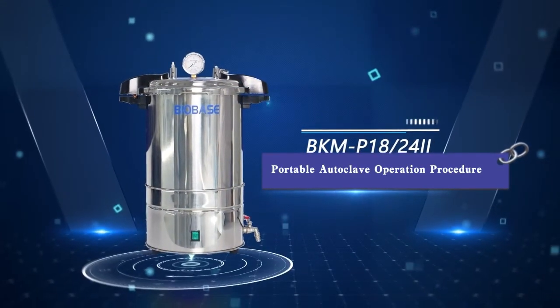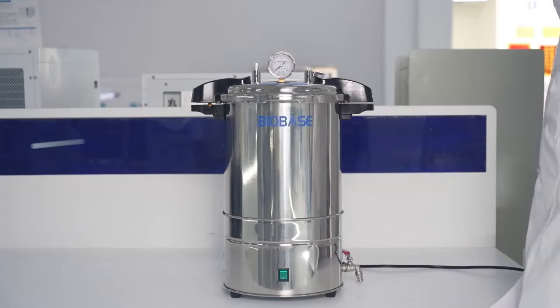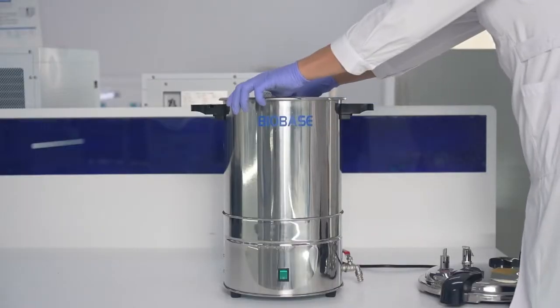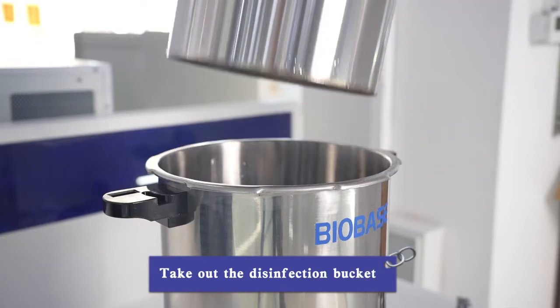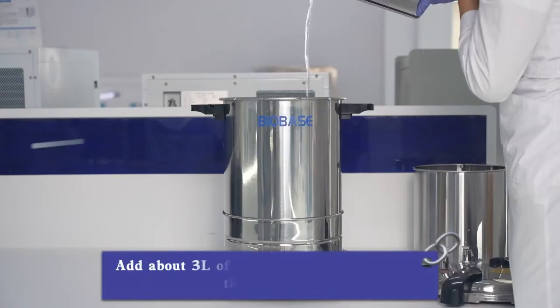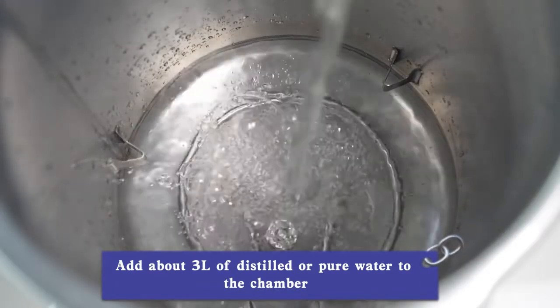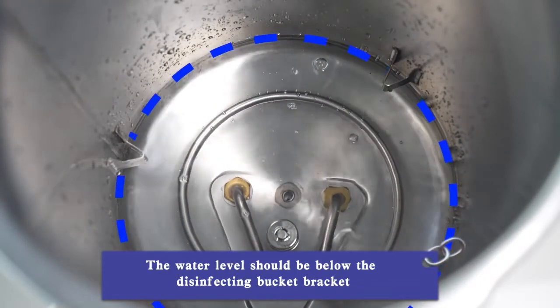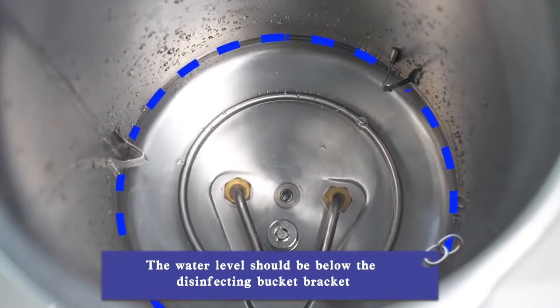Portable autoclave operation procedure. Open the seal cover and take out the disinfection bucket. Add about 3 liters of distilled or pure water to the chamber. The water level should be below the disinfecting bucket bracket.